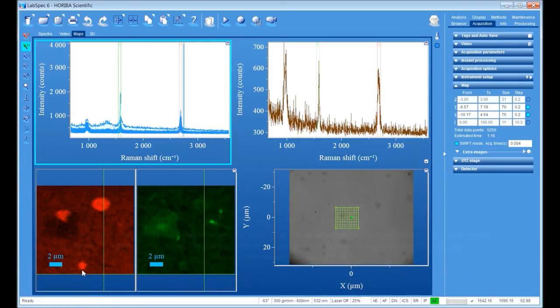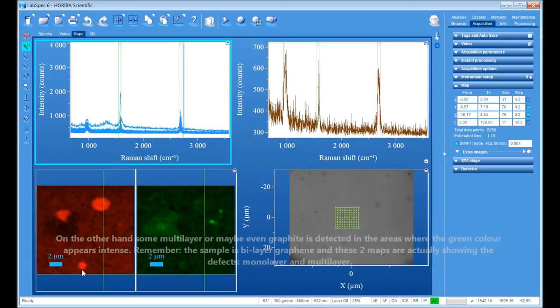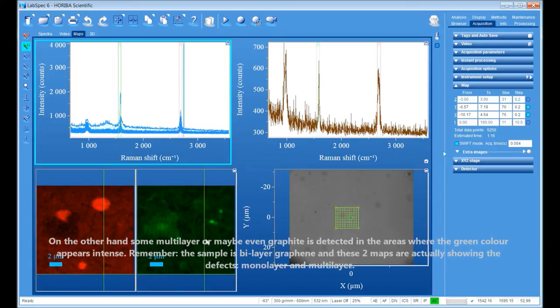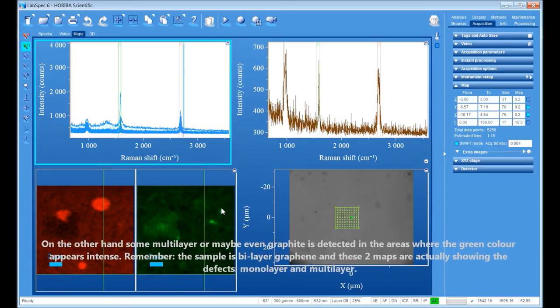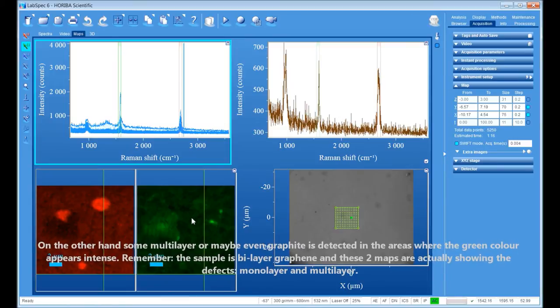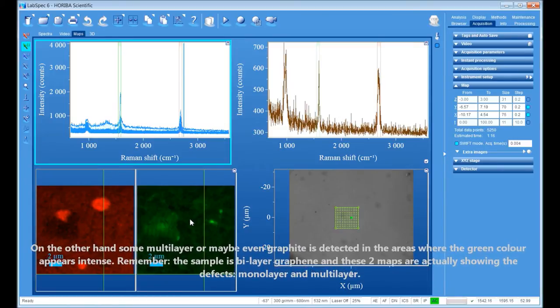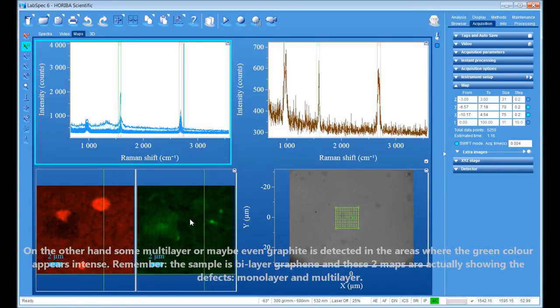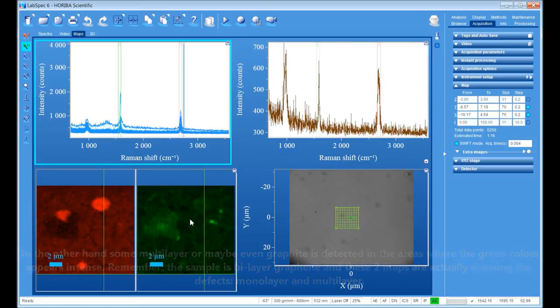On the other hand, some multilayer, or maybe even graphite, is detected in the areas where the green color appears intense. Remember, the sample is a bilayer graphene, and these two maps are actually showing the defects, monolayer and multilayer.